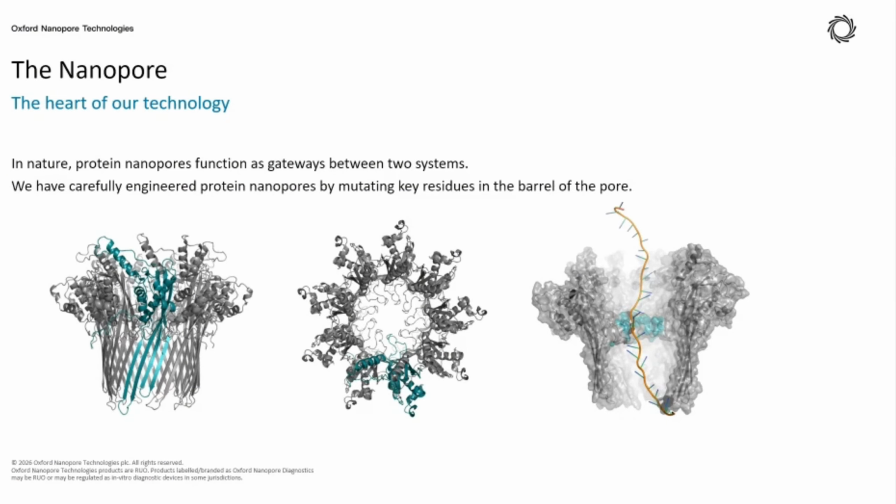We can tell the software what sequences or molecules we want to look for in our DNA samples. The software will detect the DNA molecules while they pass through the pores, and if a DNA molecule is not within our target, the software can send a signal to the nanopore to eject the DNA molecule from the process and capture another DNA molecule for the sequencing.